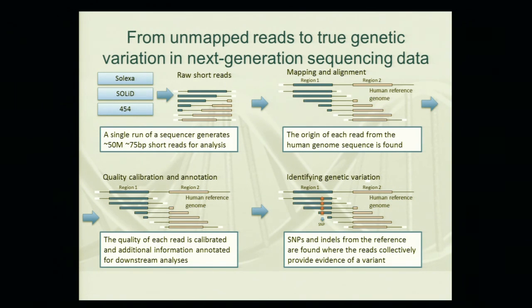So we have this reference genome, and that reference genome really defines so much of this activity. Without the Human Genome Project, sequencing as we know it would be effectively impossible. It would be a much more computationally challenging task. And if you want to learn about how computationally challenging a task it would be, you can go talk to the people in assembly, which is stitching together genomes. Without having a reference, terrible work, really hard. So we've got this mapping and alignment, and we're trying to match up where things go. Once we've mapped these reads, so we've plunked down the reads on the genome, we're like, you read, you go here, and so on and so forth.